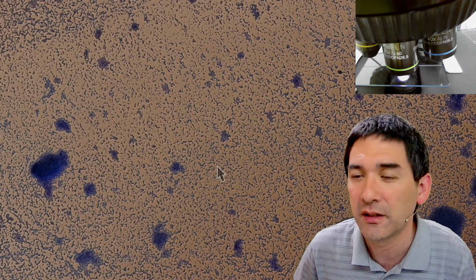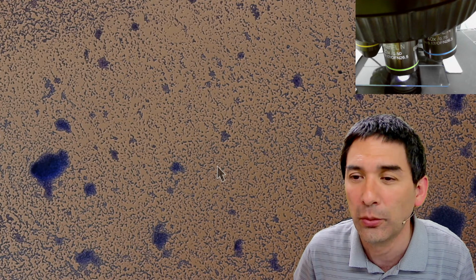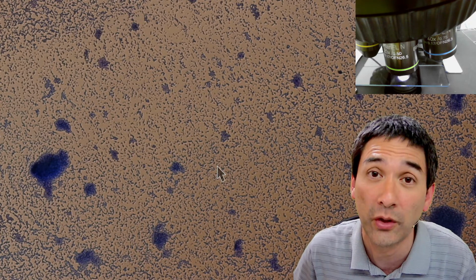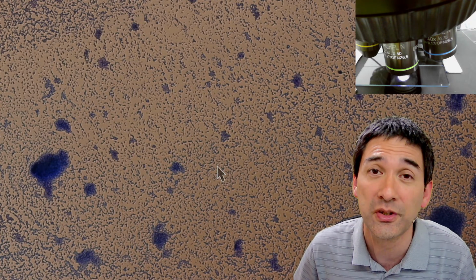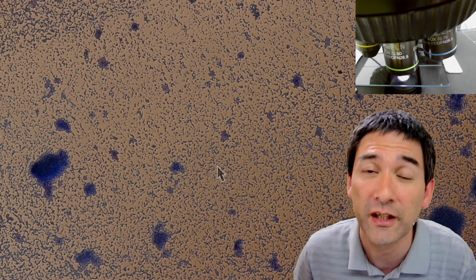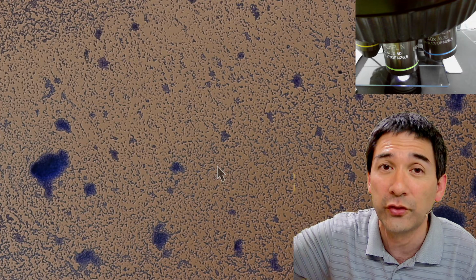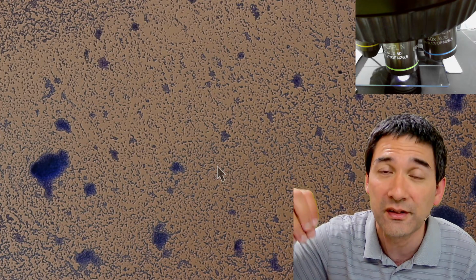I once, many years ago, bought a stereo microscope, and I was rather disappointed. It was very nice quality when I looked through it, but I was very disappointed with the pictures it produced when I connected the camera on top, because some of the optics did not work very well with the camera optics of the adapter.